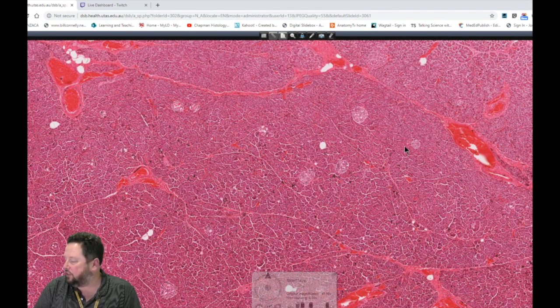I'm thinking Ashkovsky or Shivsky. Yeah, so the only thing that's come up, but it's definitely more of a pathological thing, is these Rokitansky-Aschoff sinuses. Whether they're what you were pointing to, I'm not sure. Yeah, they tend to be deep. That's the term that I've heard before.